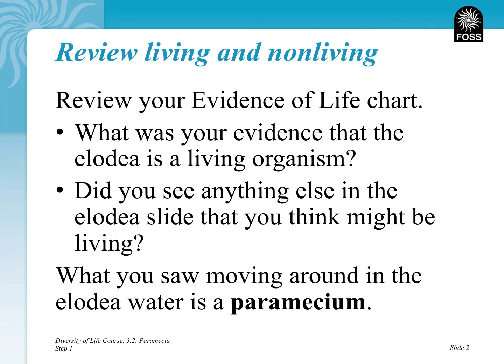Before we look at our paramecium, we're going to spend a little time to look at that evidence of life chart. Question 1, what was your evidence that the Elodea plant is a living organism? Go through that checklist and see if there's anything that you saw from the Elodea if it was going to be a living organism. Question 2 was, did you see anything else in the Elodea slide that you might think might be living?